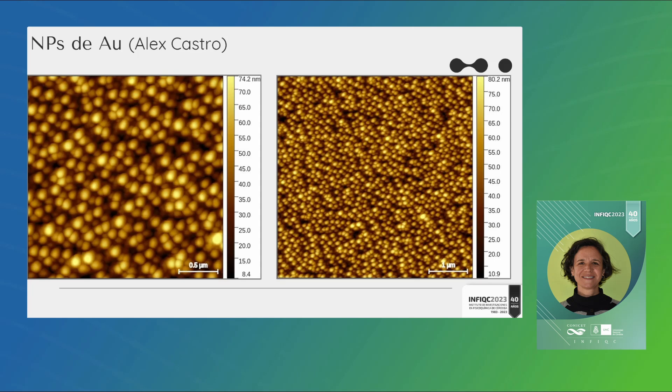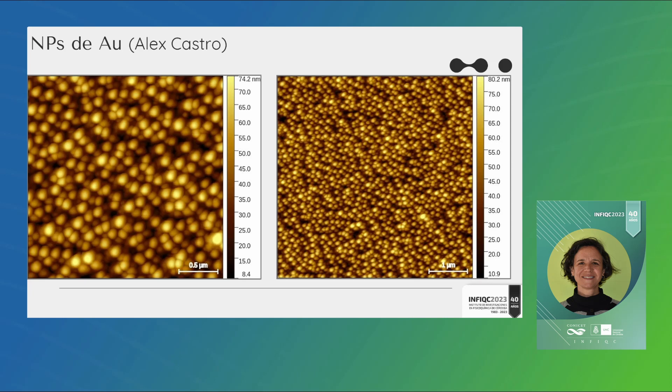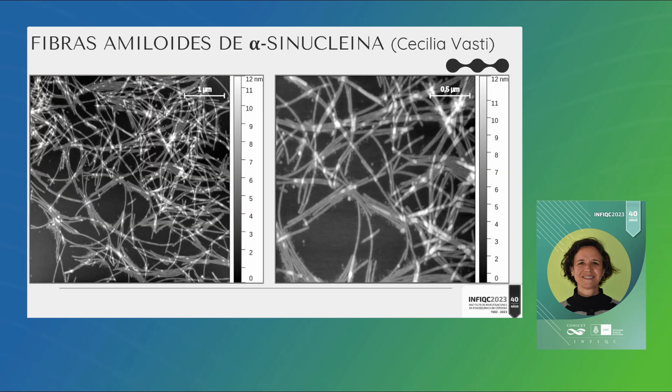Este es otro ejemplo de ahora sí partículas sobre un dado soporte. Es un ejemplo de un postdoc que estuvo en el departamento bajo la dirección de Coronado, Alex, que son nanopartículas de oro sobre mica. Es importante acá no solamente que queden adheridas y que uno no las barra, y eso tiene que ver con el tamaño de la nanopartícula también, si es más chico o más grande, si adhiere mejor o peor. También la limpieza, porque yo sé que es oro porque me dicen que son nanopartículas de oro, el AFM no distingue la química. Tengo que saber yo que esté suficientemente limpio y que eso es oro. Otra cosa interesante es que si uno quiere discernir cada una de las partículas también es importante la concentración que yo pude absorber en esa superficie.